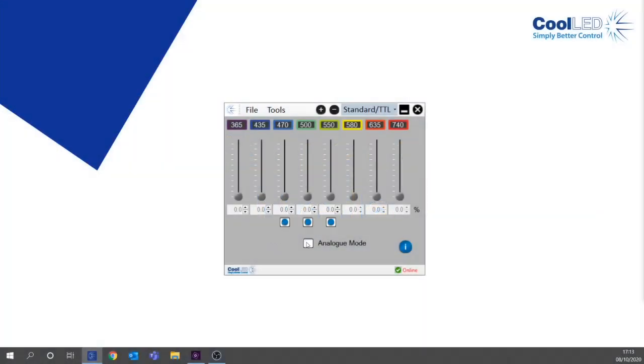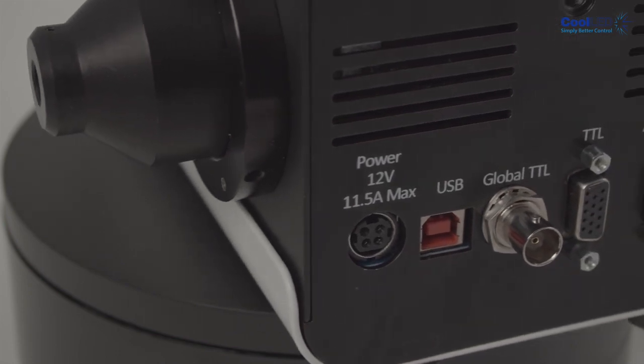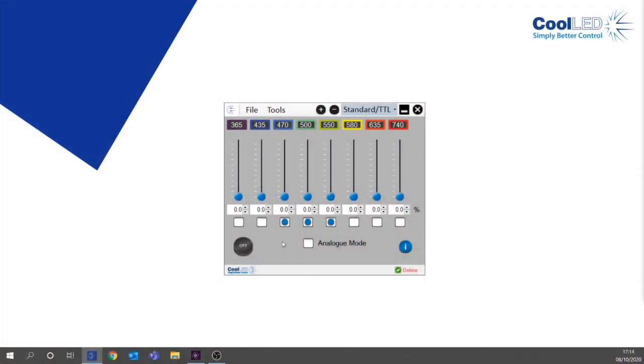The P800 illumination system is unique in featuring an 8-channel sequence runner for affordable high-speed imaging. Illumination sequences can be triggered with just a single TTL out from a camera or other external hardware. Once you have your TTL input connected to the BNC of the light source, navigate to Sequenced mode in the drop-down menu to set up and control Sequence Runner.